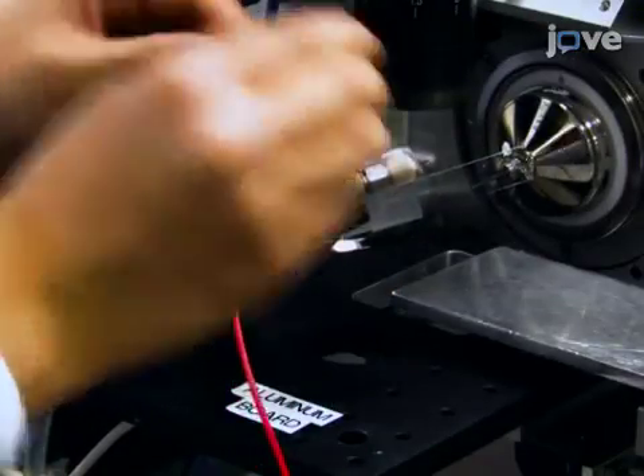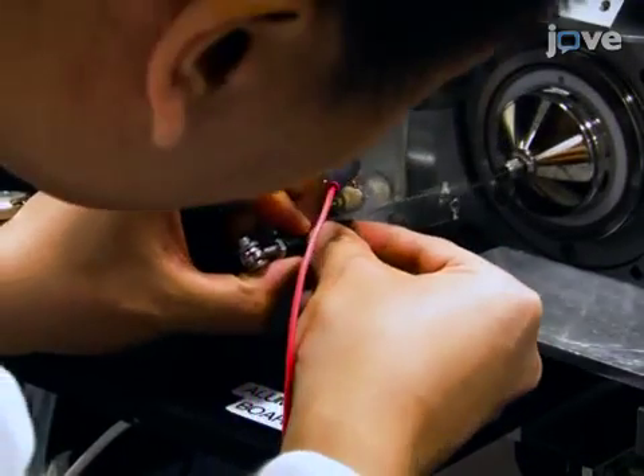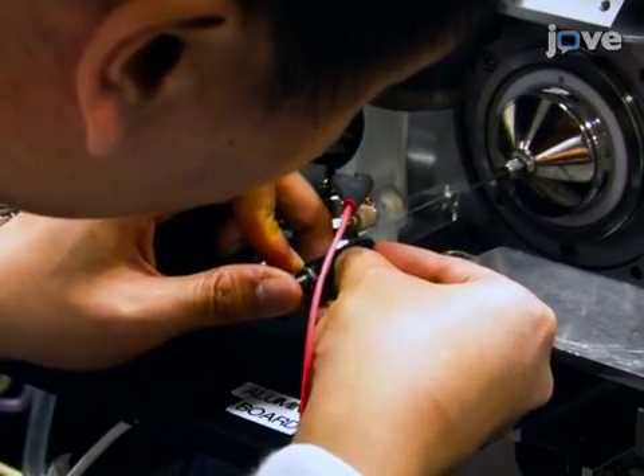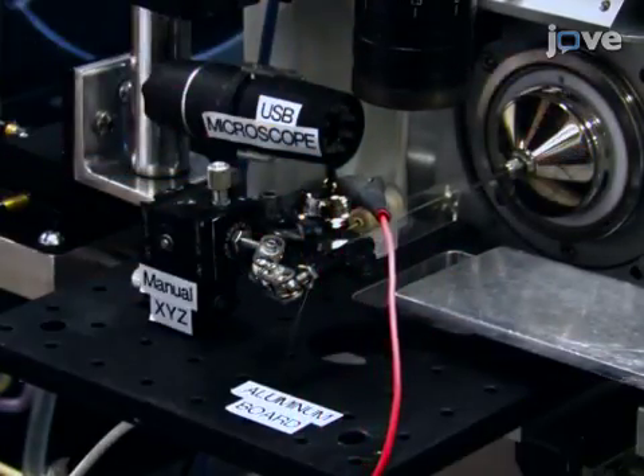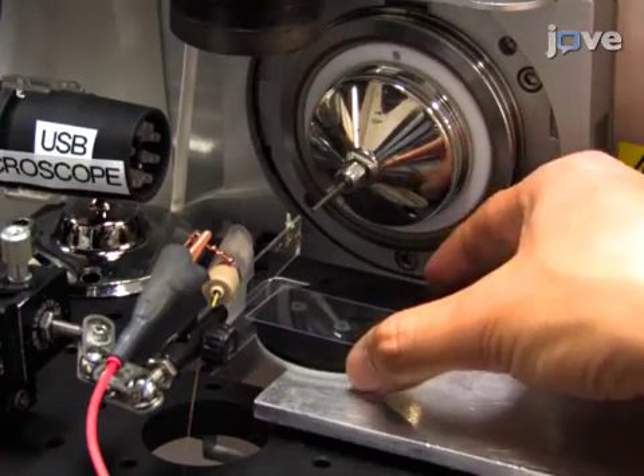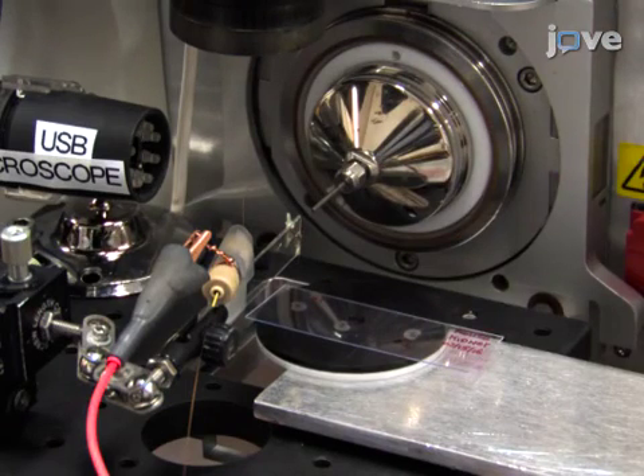Adjust the flexible clamp holder and the miniature XYZ stage to place the emitter of the single probe in front of the inlet of the mass spectrometer. Thaw the sample section at room temperature and place it onto the motorized XYZ translation stage system underneath the single probe.